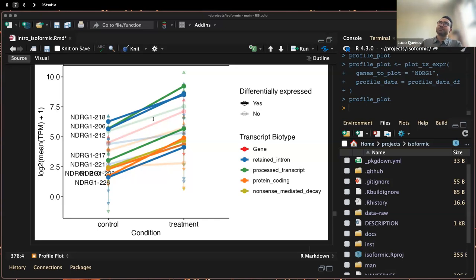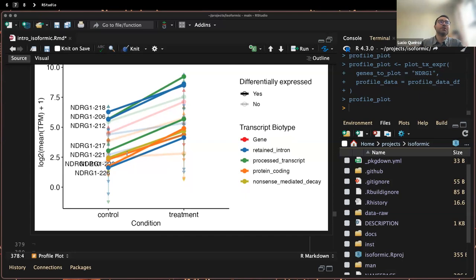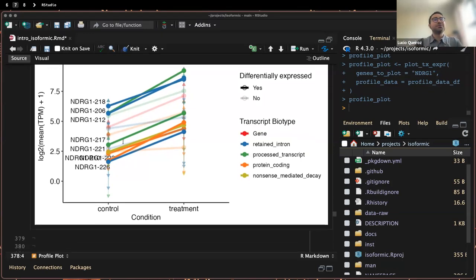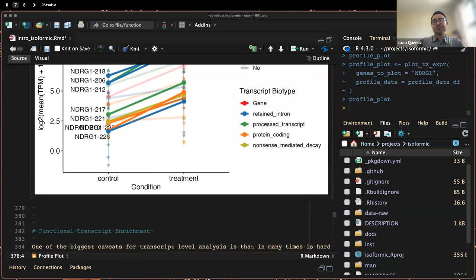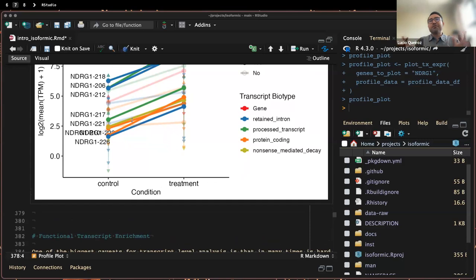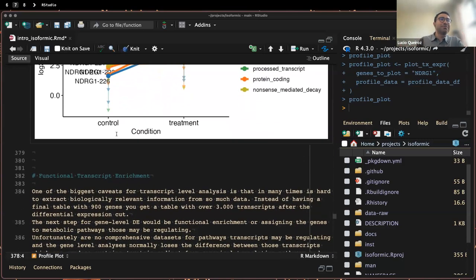And if you use the bootstrapping methods like Swish uses, using Gibbs sampling, for example, in the Salmon implementation, they are really good in distinguishing the uncertainty around how that read was assigned to a specific transcript that comes from the same region. Because in some cases, you're definitely not going to be able to differentiate them. And that's normal. That's part of the biology.